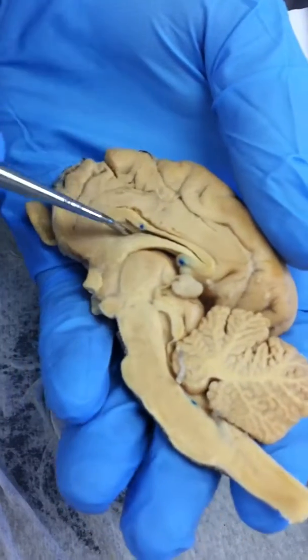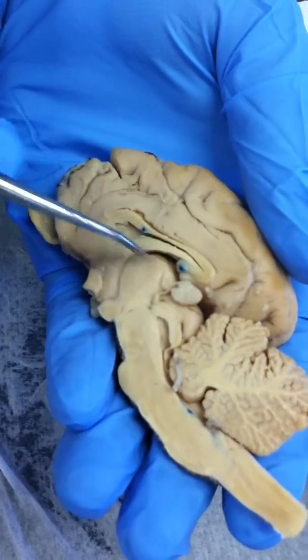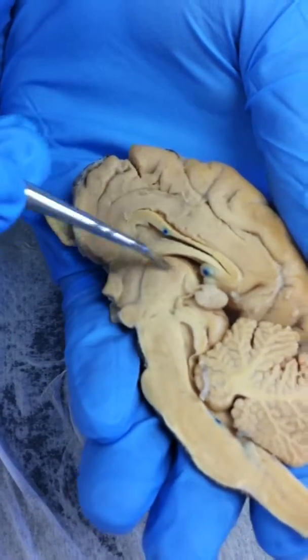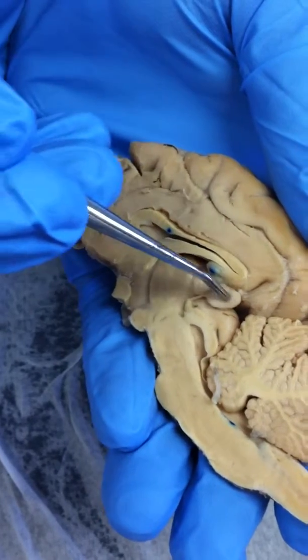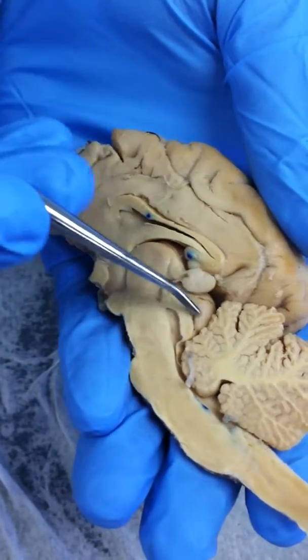Then right after that, right under this, the third ventricle. That space right there. Wait, the top one was a lateral ventricle, right? Lateral ventricle. And the third ventricle. Then the thalamus is this round piece right here. Then we have the pineal body, pineal gland, which is right there. Then we have the corpora quadrigemina, which is the superior and inferior colliculi, which is right here.